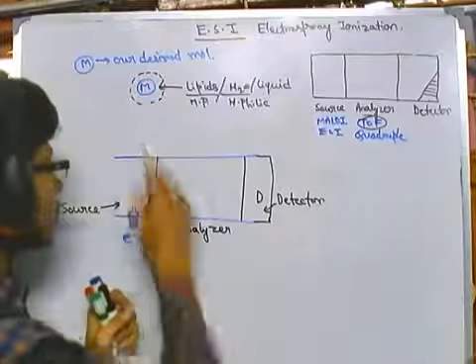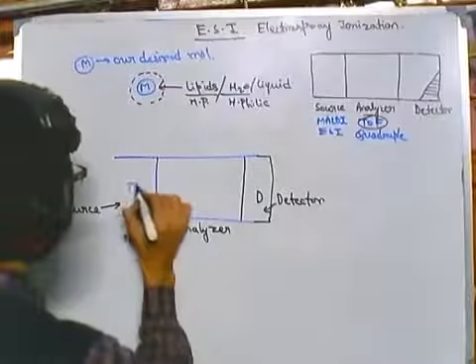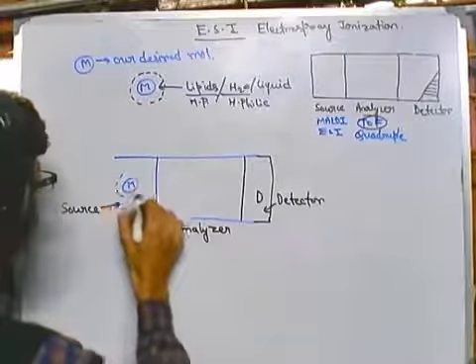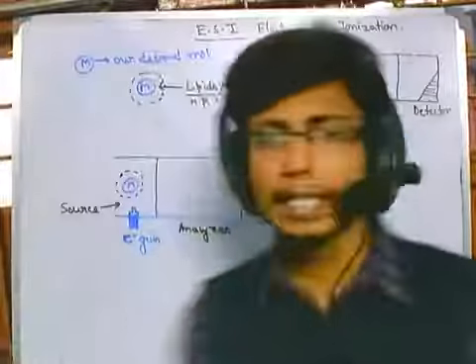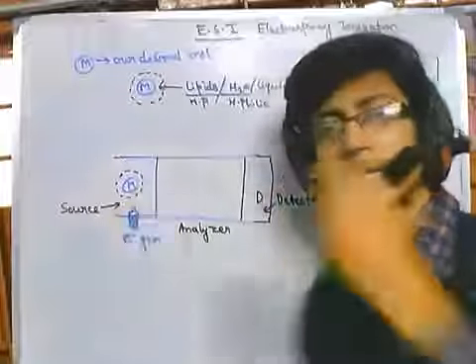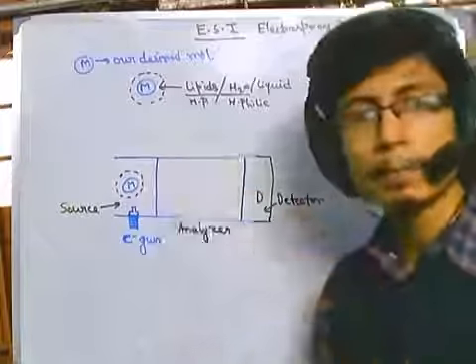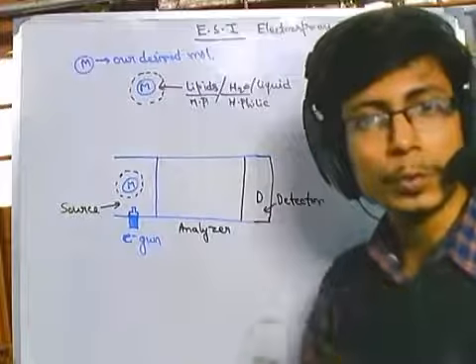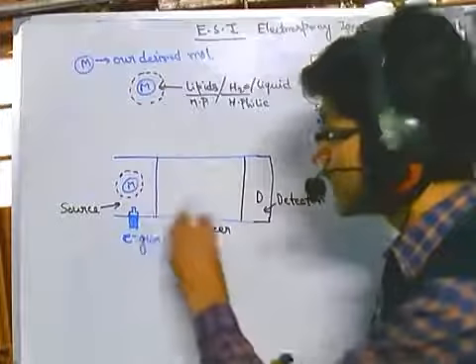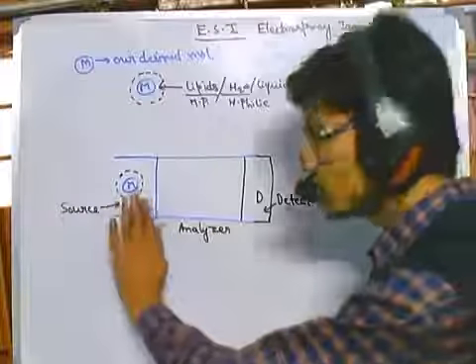And remember, here we have the micro droplets, and in many cases we can find an electron gun. Obviously in many cases there shouldn't be any electron gun. Instead of the electron gun, there are other ionization processes like chemical ionization. Usually this ESI is connected with a quadrupole analyzer. Remember, we have already talked about the quadrupole analyzer, and in this ESI process the analyzer is slightly modified, and usually they don't use an electron gun.